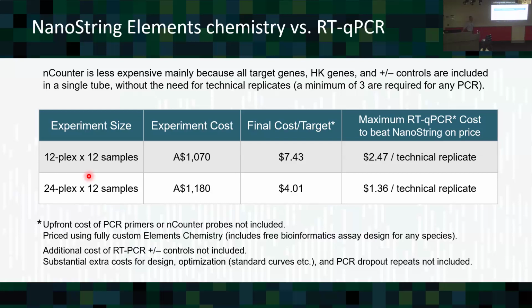By validation, RNA-seq, you love it as a good initial exploratory tool. RNA-seq is a massive amount of data because you've got to sequence through the high expressors. So a lot of your sequencing ends up being junk because you don't learn anything.